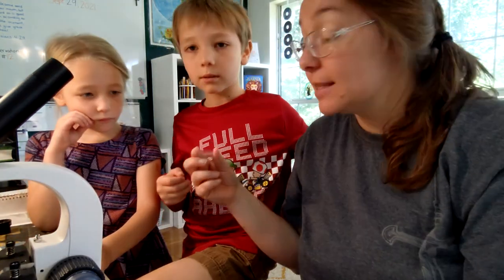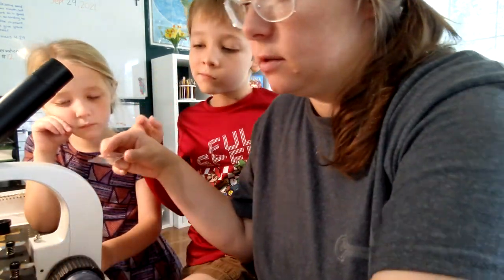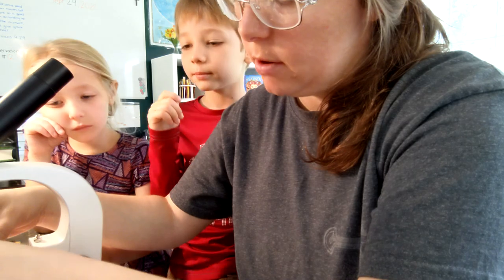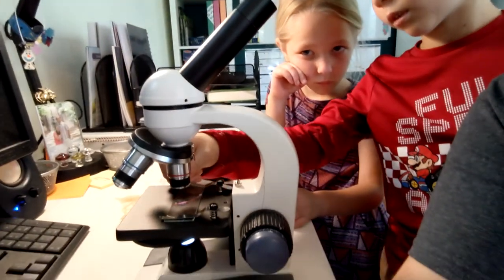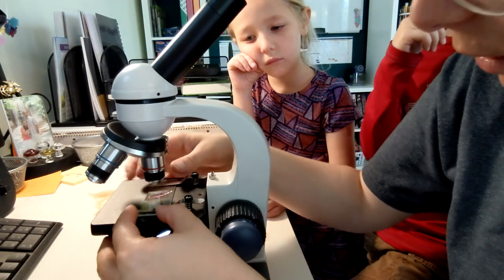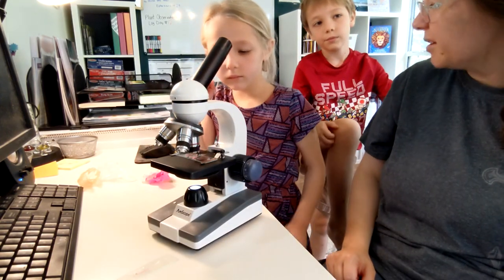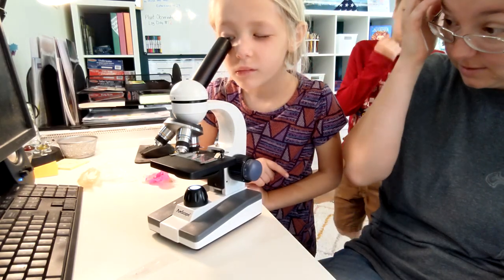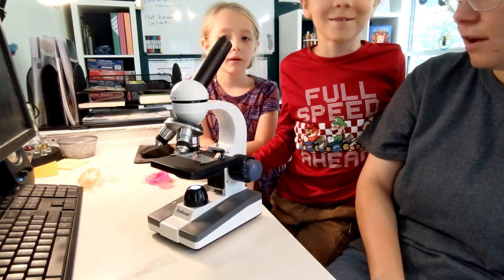What a microscope does is it takes what we put here on the slide and makes it a lot bigger. Okay, so this is Jonathan — why don't you move these to the side and place it right in the middle. These clips here — be gentle because these slides are glass. All right, here we go. So what you're going to have to do is close one of your eyes. Do you see it?